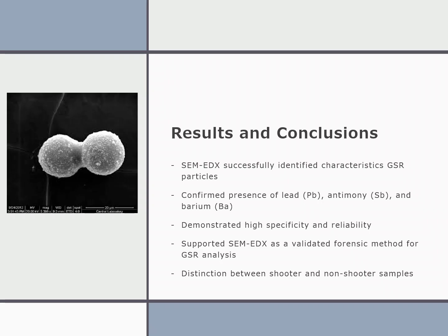Results and conclusions of the study. The study demonstrates that SEM-EDX accurately detected GSR-specific elements and particle morphology. It showed reliability in distinguishing true shooter samples from non-shooters. The results confirm that SEM-EDX meets forensic standards as a validated, court-accepted method for GSR identification.